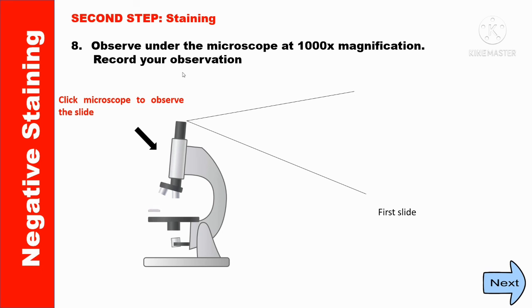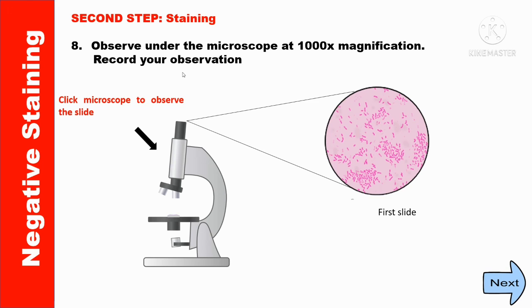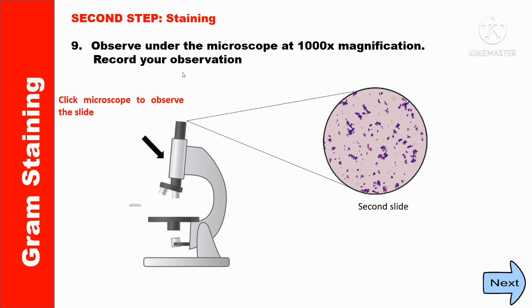The first slide looks like this, and this is the second slide.